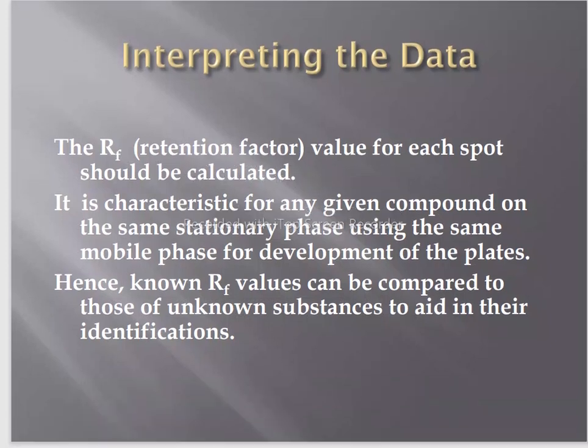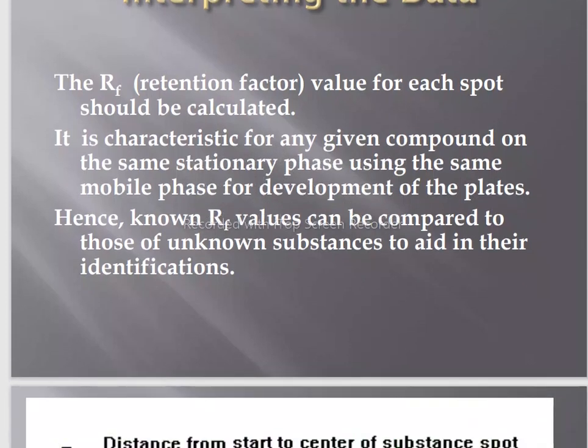Interpreting the data. How to interpret the TLC data? The RF, retention factor, value for each spot should be calculated. It is characteristic for any given compound on the same stationary phase using the same mobile phase for development of the plate. Hence, known RF values can be compared to those of the unknown substance to aid in identification.